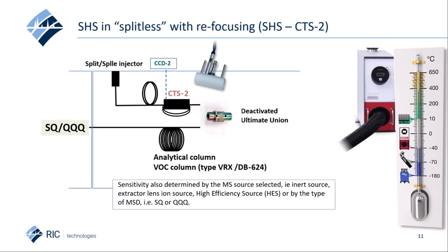Please take note of the remark added at the bottom of the slide, where of course the overall sensitivity of our headspace method will also depend on the choice of mass spec, equipped with a certain type of source.